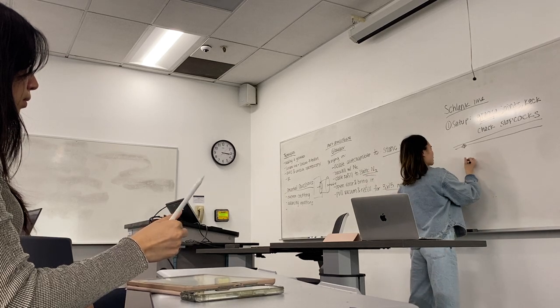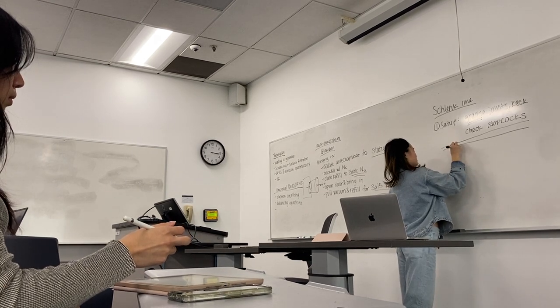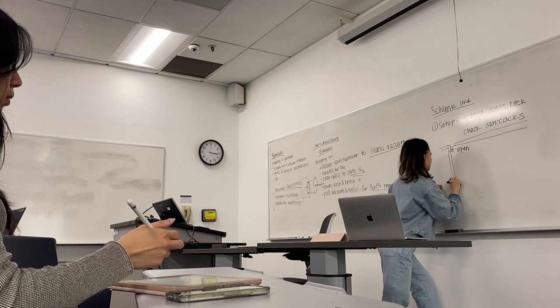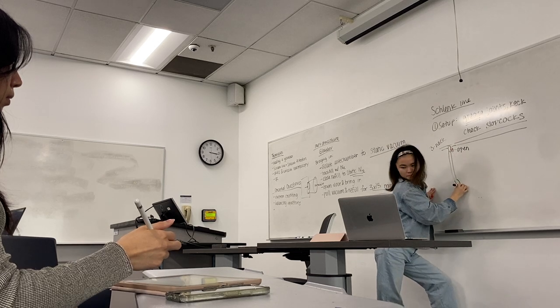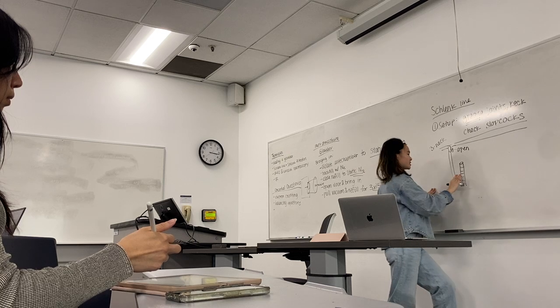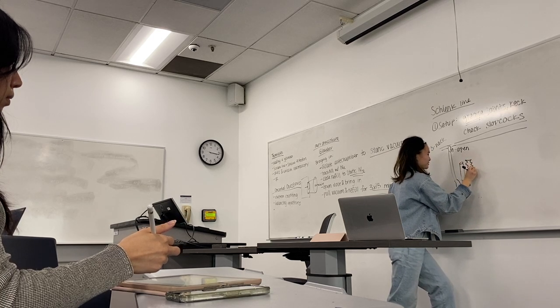I don't think that's how you draw a two-way stopcock, but that's fine. Let's just assume this is open. This is open. I'm drawing a 3-neck flask in this case. That's not what a condenser is. So this is an addition funnel, I'm sorry. And then this is a condenser. A little squiggly. That's what they look like.